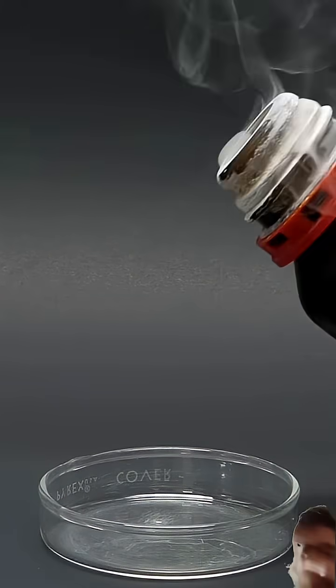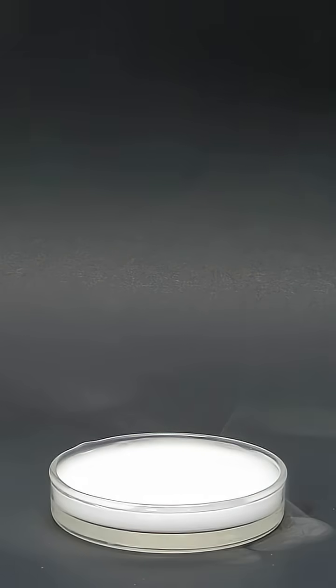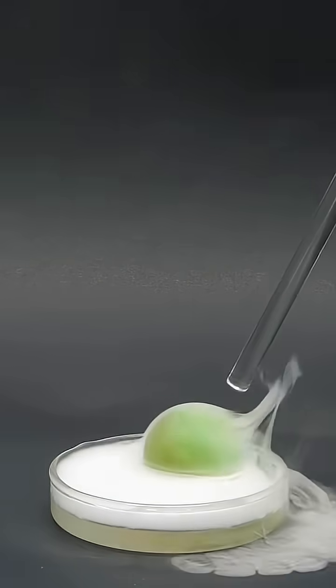But anyway, what I've always wanted to do was try and soak a super ball in it. So I dropped in one that I got from the dollar store, and I let it sit for a couple minutes.